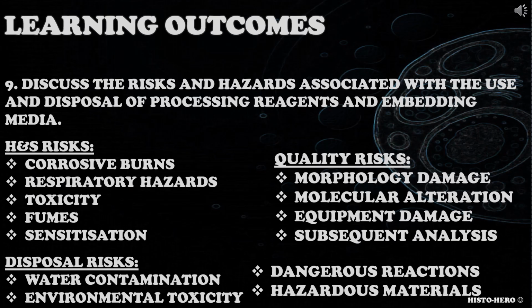Consider health hazards, safety hazards, environmental hazards, COSHH, SOPs, PPE, risk assessments, training, regulatory bodies, waste segregation. How would you mitigate those risks and hazards? You're using a table. Those are the 9 learning outcomes that have to be met for this submodule.